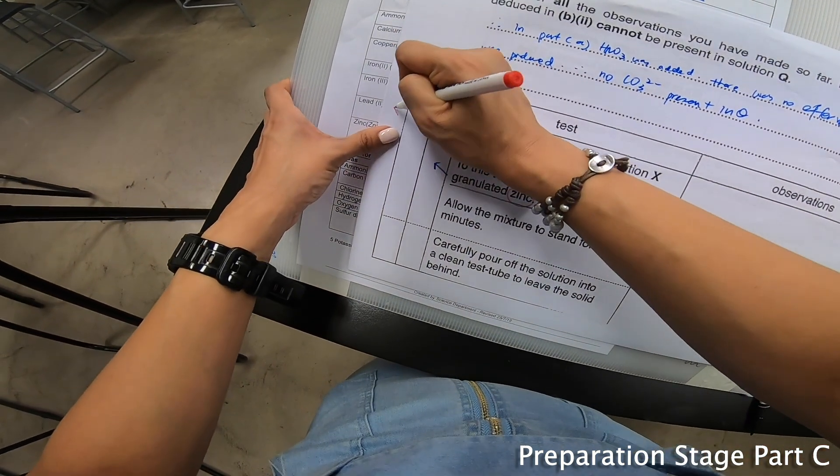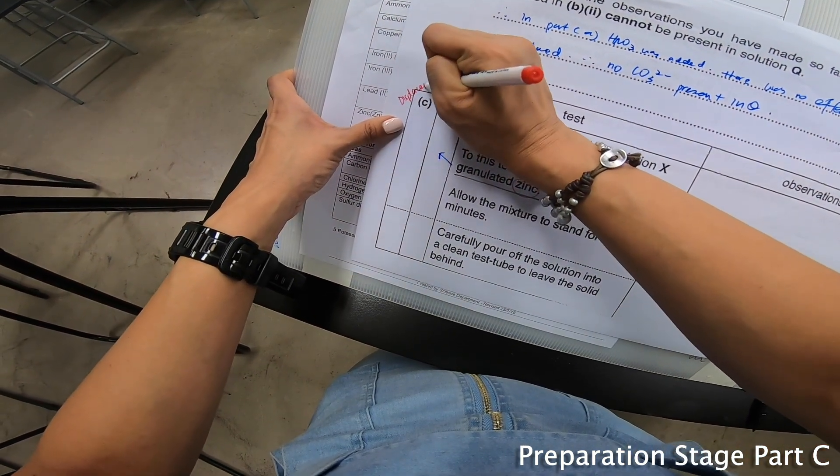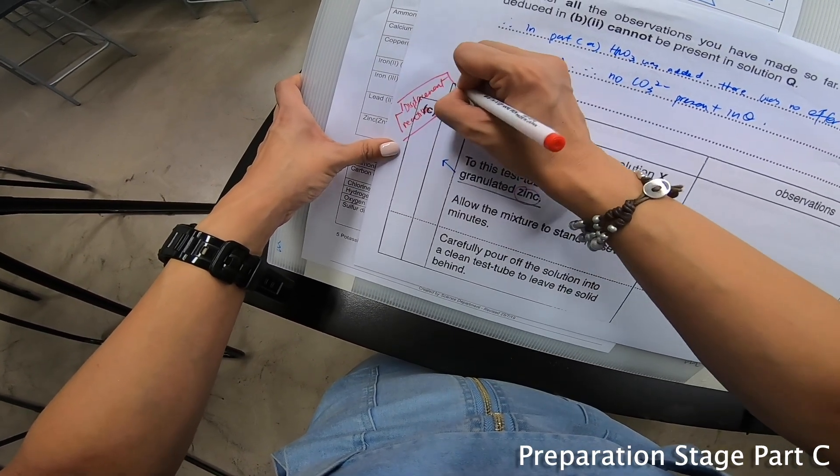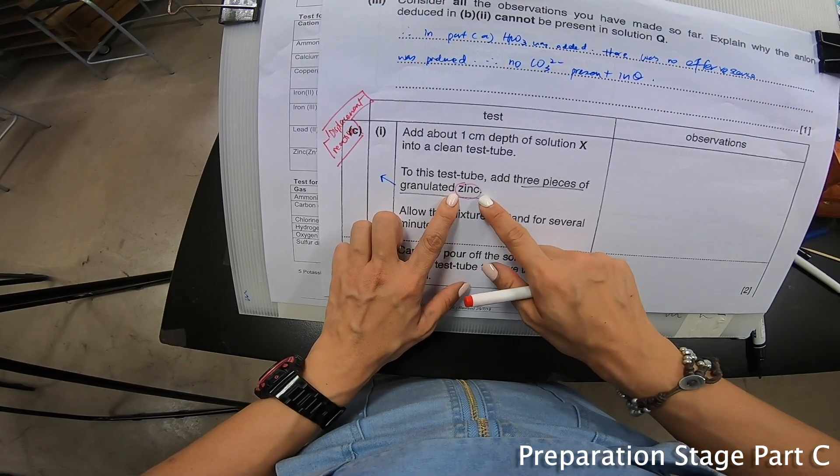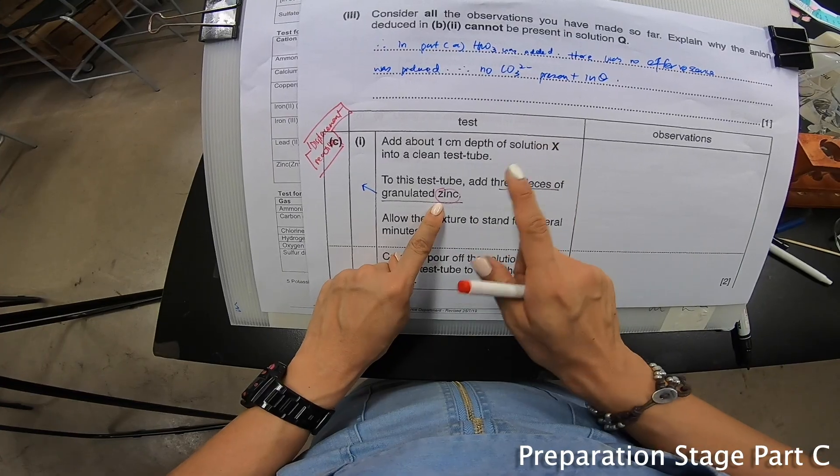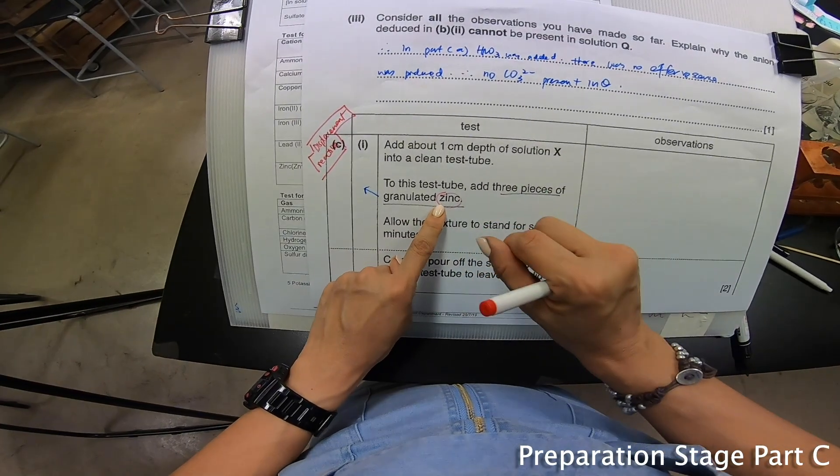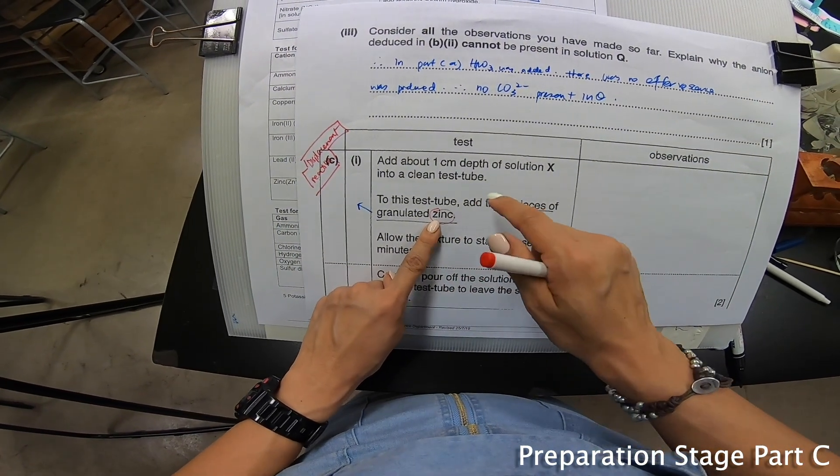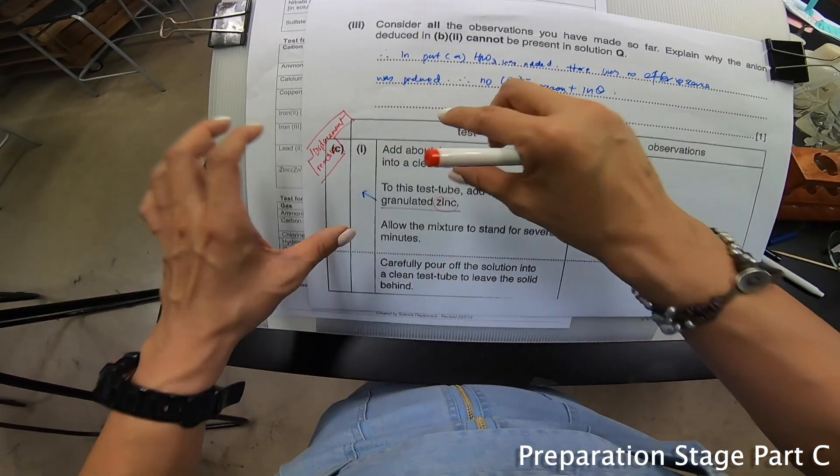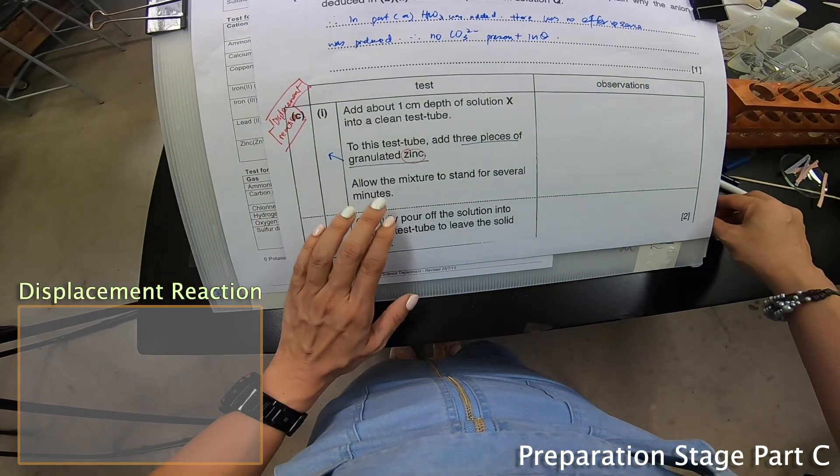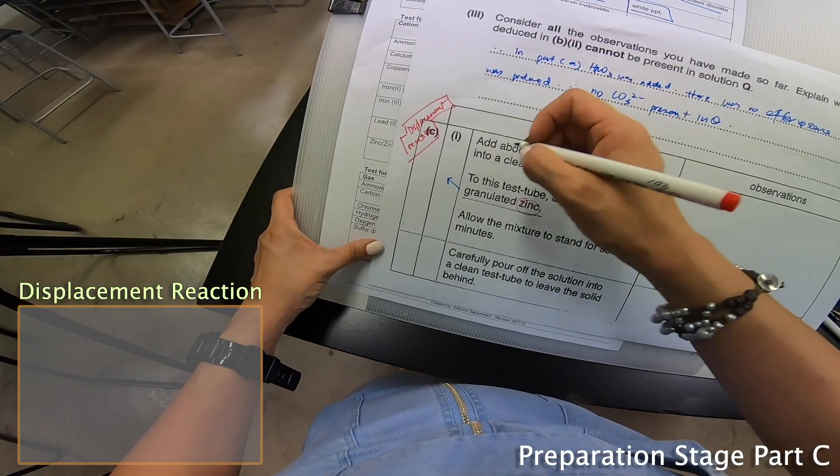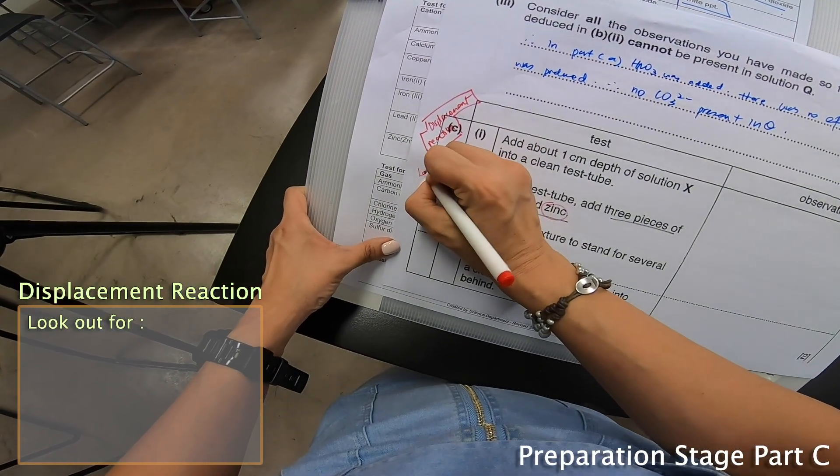Why do I stop here? Please bear in mind that when zinc is added, zinc is a metal. When a metal is added, this is actually a displacement reaction. Sometimes they will add zinc, sometimes magnesium. When a metal is added, it's always a displacement reaction. When displacement occurs, there are a few things you look up for: look up for color change, look up for bubbles.